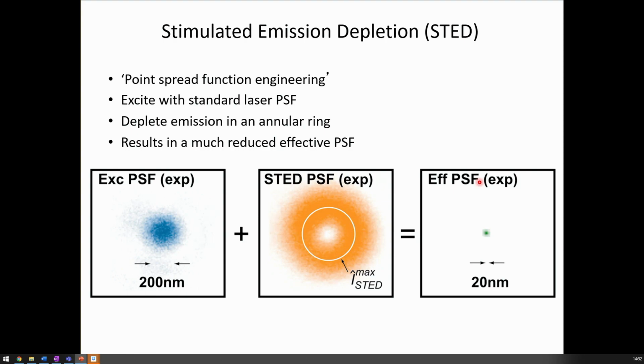So if you stimulate the emission down as soon as it arrives up there, then you get a stimulated emission photon exactly along the laser beam. But it is not a fluorescence photon. And so the key now instead is to stimulate down using a color that is different to the excitation color. So let's have a look at this.